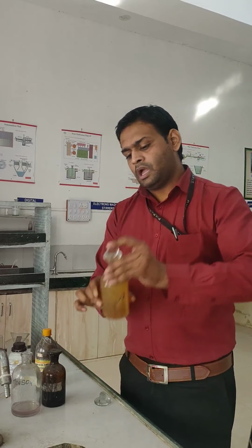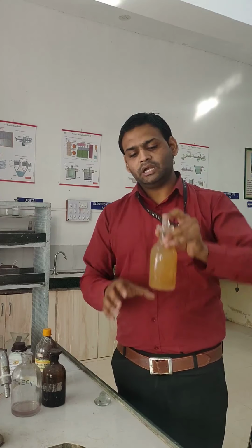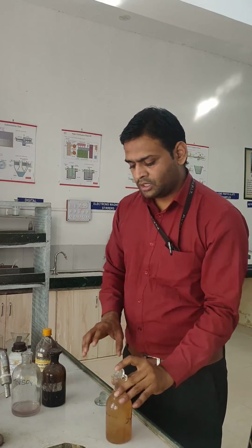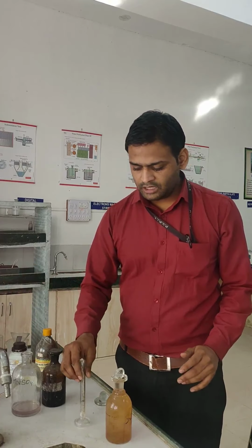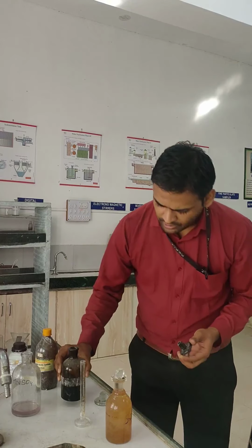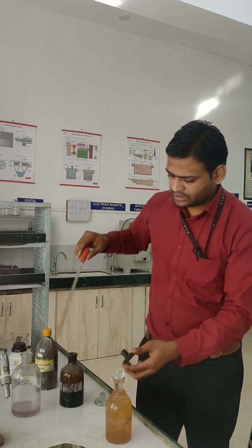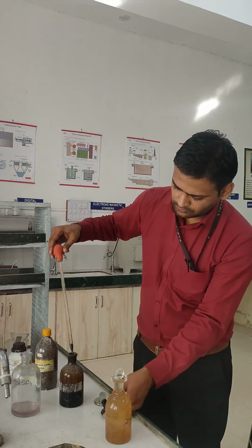After adding manganese sulfate and alkali iodide azide, this solution will form a brown precipitate, and we have to wait for this brown precipitate to settle at the bottom. Then in the next step we have to add 2 ml of concentrated H2SO4 into this solution.